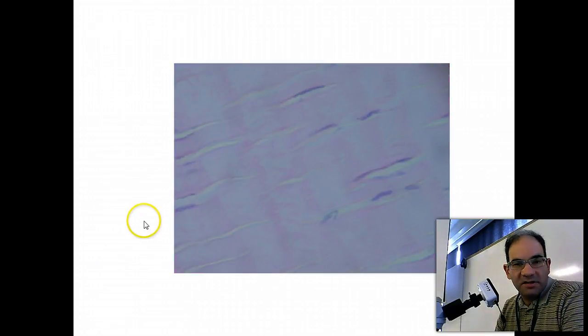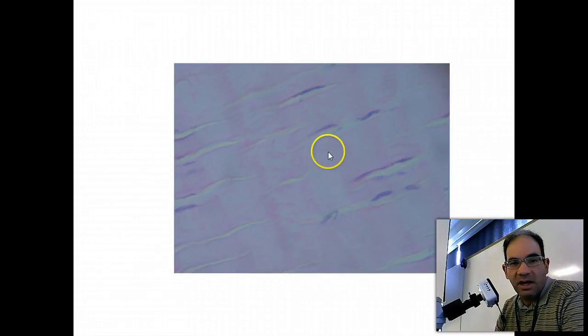Here is another slide of dense fibrous connective tissue just for comparison. And I wanted to show you that you can still see the white spaces in between the bundles, and you can still see the dark staining nuclei of the fibroblasts. So take a look at this slide too, and make sure you can recognize this tissue type.